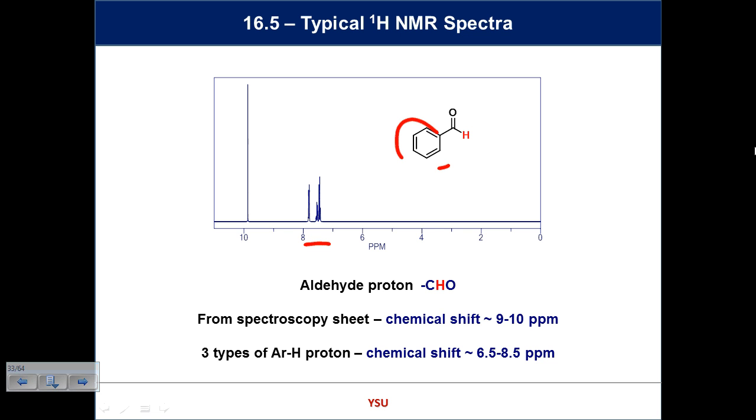No, it's more to do, we haven't really defined benzene yet, but it's all to do with the proximity of the carbonyl to those protons, and then less so to these protons, and that proton is exposed by resonance effects. We haven't spent a lot of time on resonance and benzene yet, but we will, and show why those things are further downfield. And by the time we get to the next exam, you'll be able to do this with benzene, and it's lots of fun.